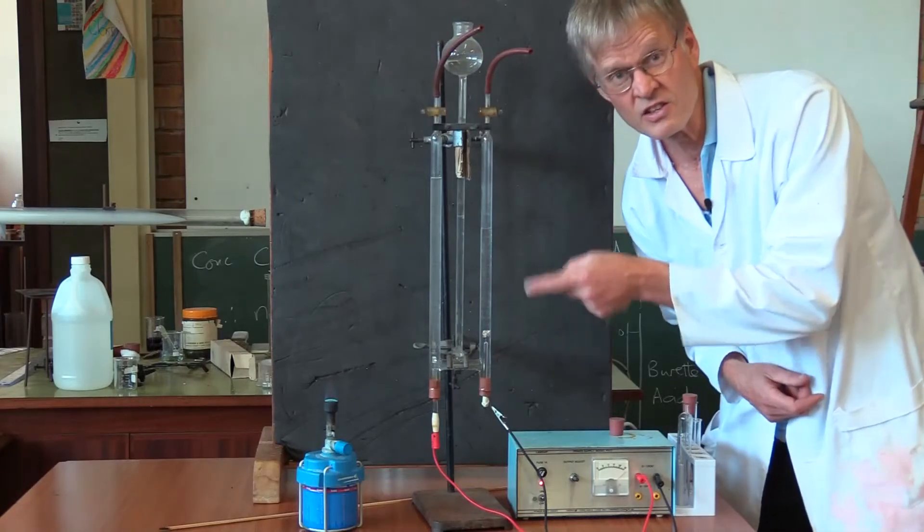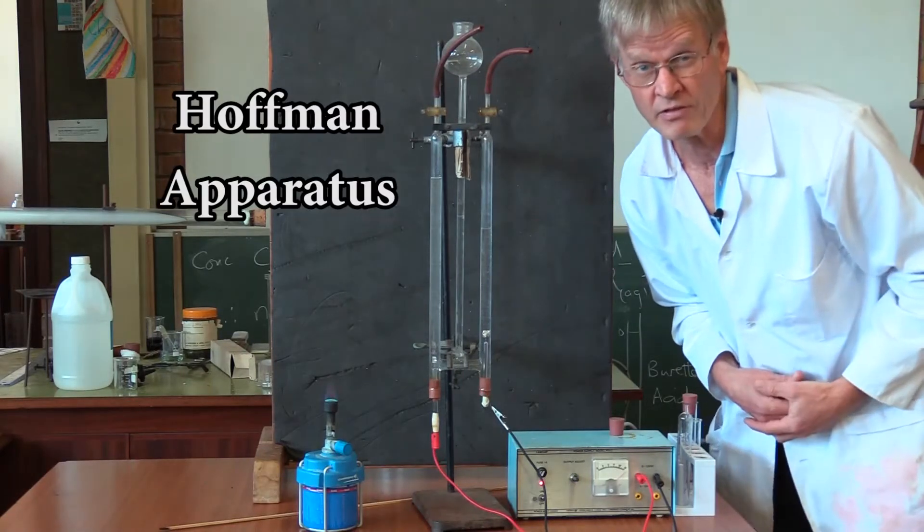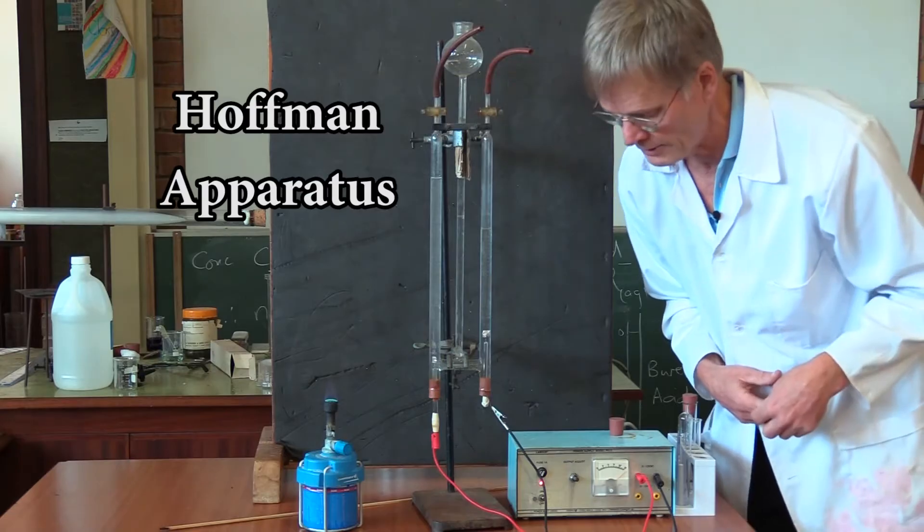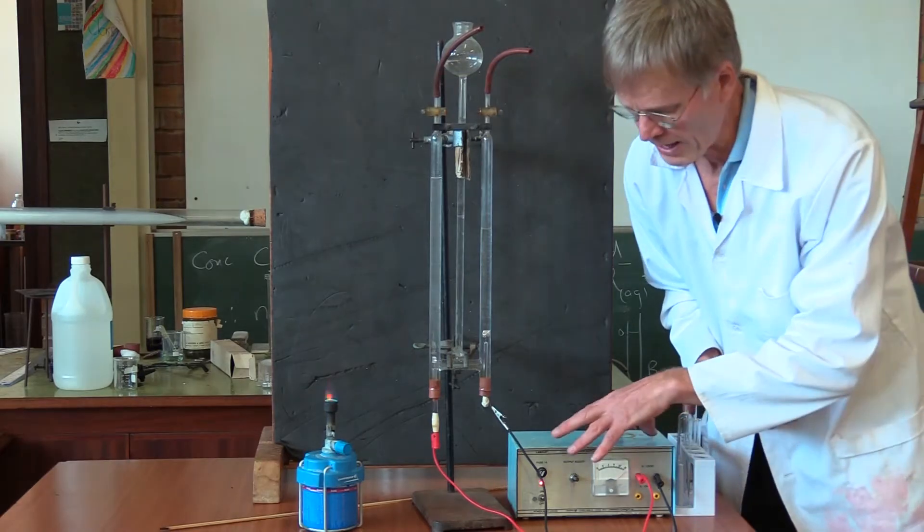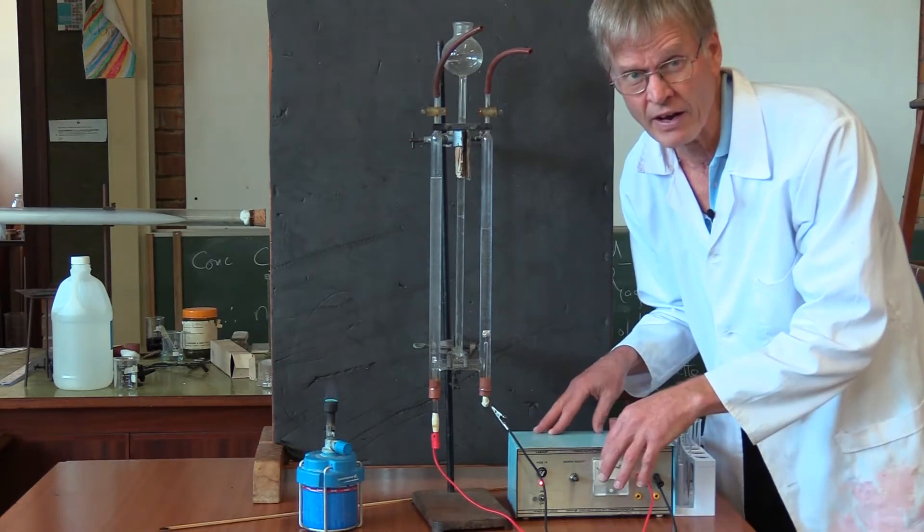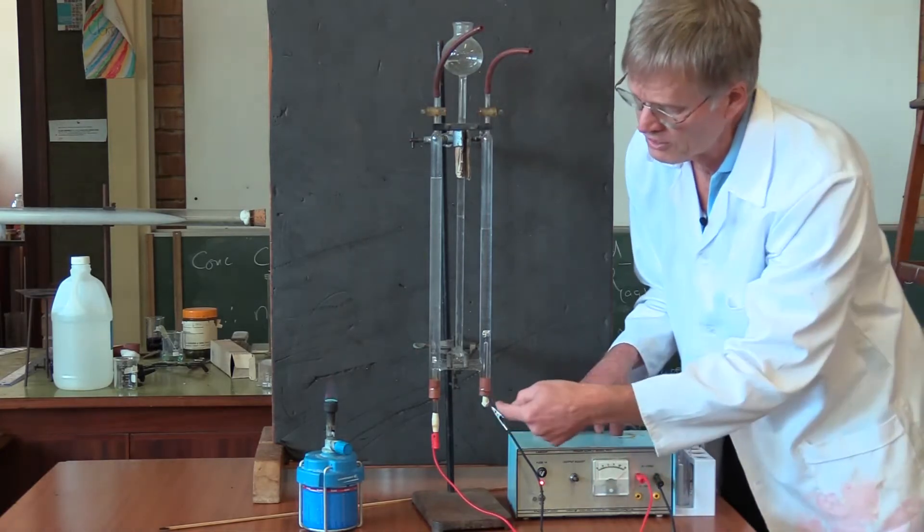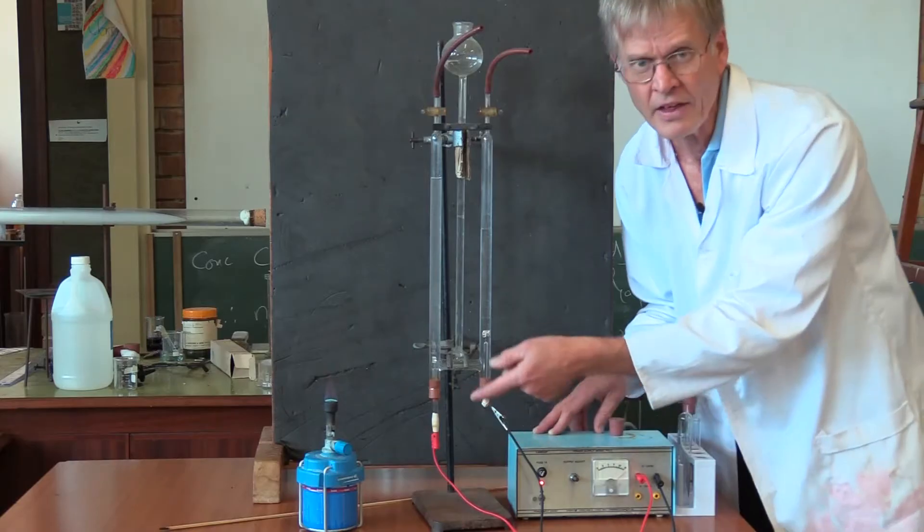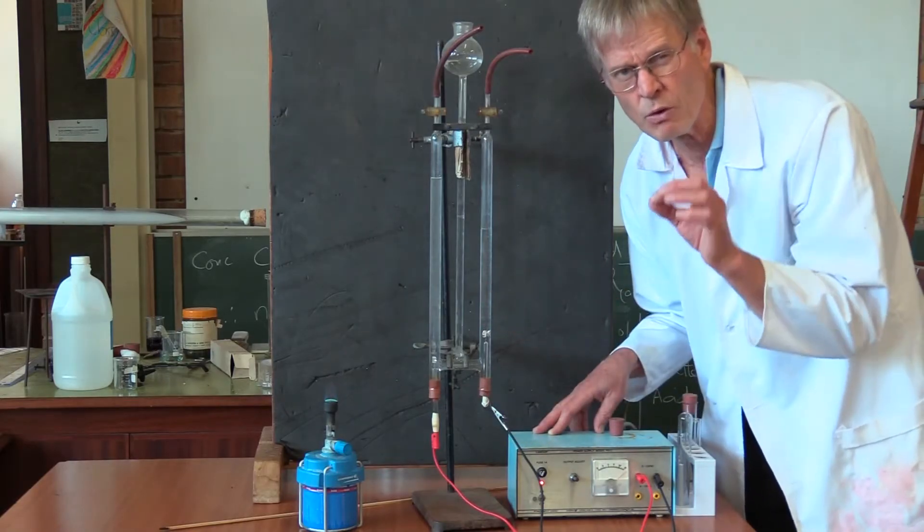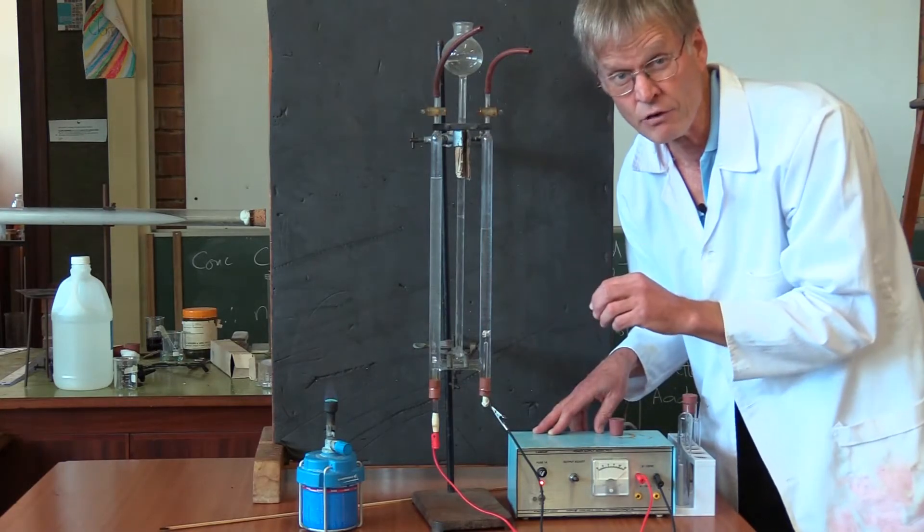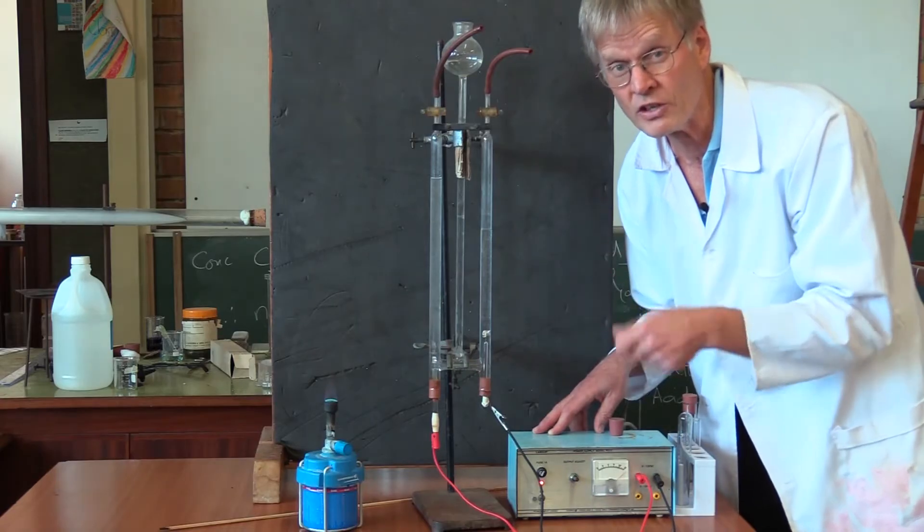Hi guys, this is a strange looking instrument called the Hoffman voltameter. Let's just explain it. We have a source of electricity, direct current, and we've got positive and negative terminals attached to two terminals that are inside some water with a small drop of sulfuric acid just to allow it to conduct electricity.